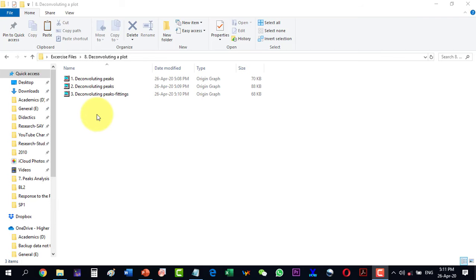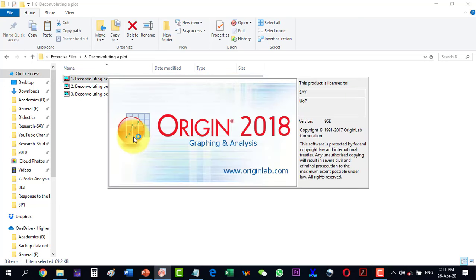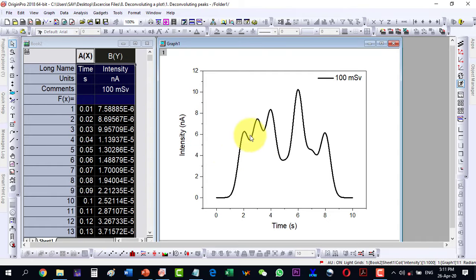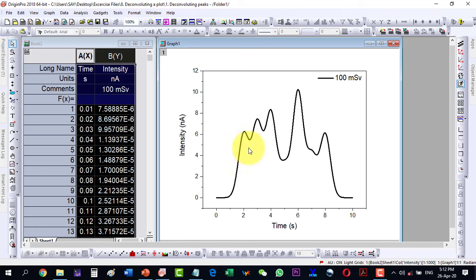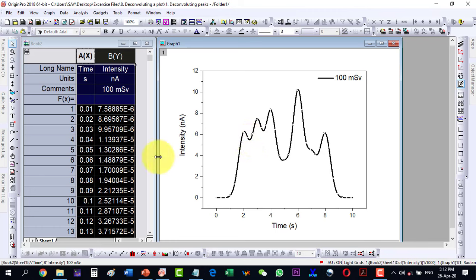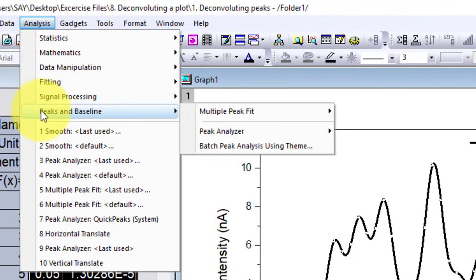In this video we will talk about how to deconvolute a collection of peaks into individual peaks. Let's open this one. I can see that this plot is a collection of five peaks, and each peak corresponds to an individual entity. Sometimes we want to calculate parameters of a given peak, so for that purpose we will have to deconvolute this plot into its individual peaks.